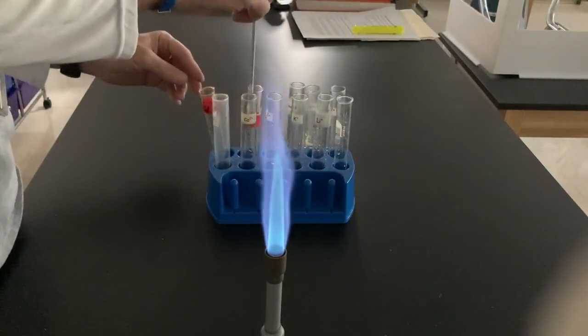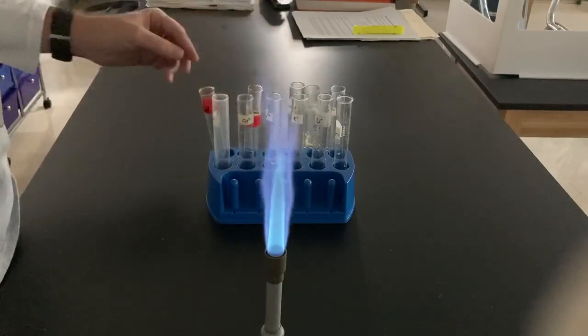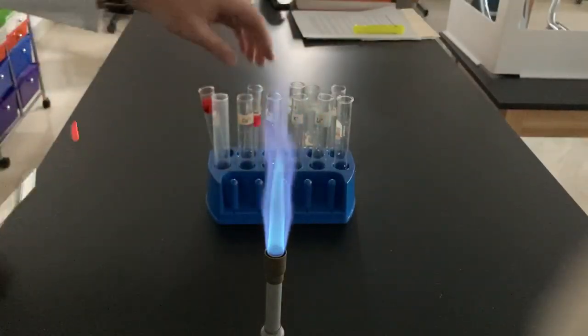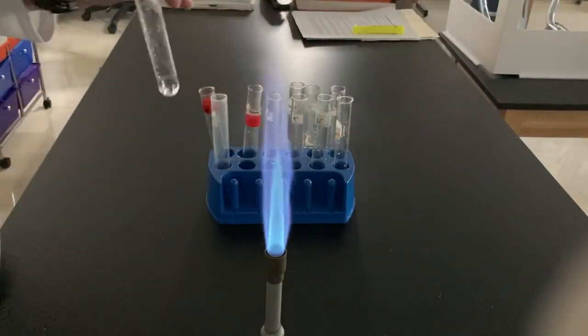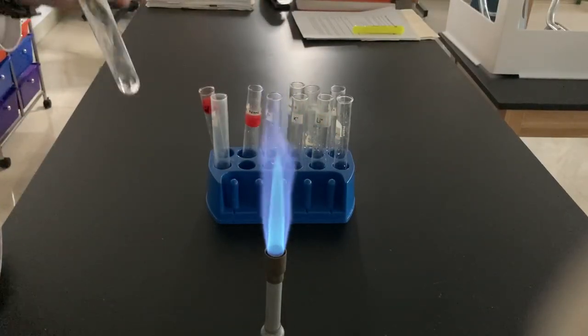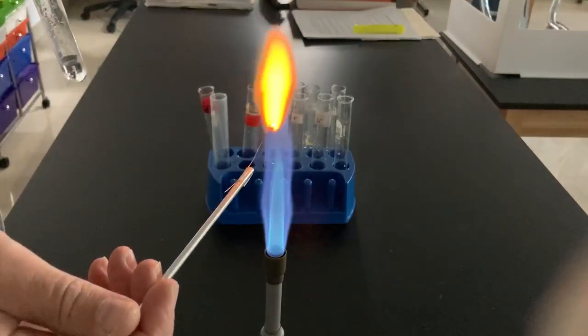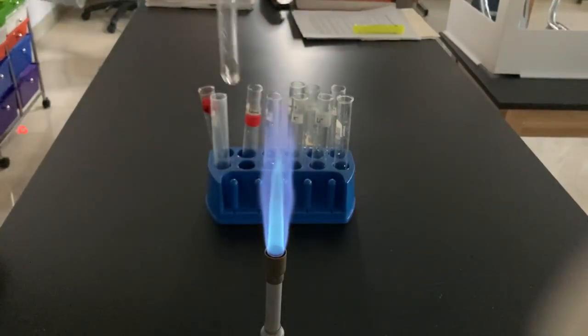Next up we have calcium. Now ignore that green — that green was not supposed to be there. Let's try a little more calcium. Calcium kind of had that reddish orange color.